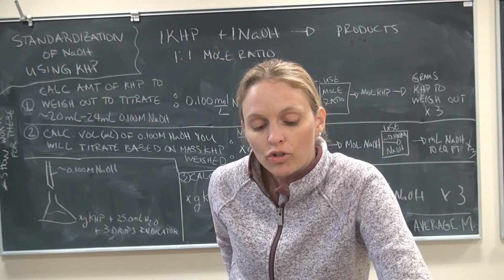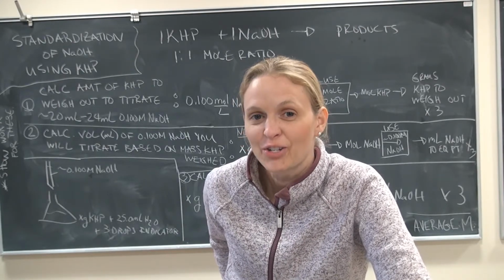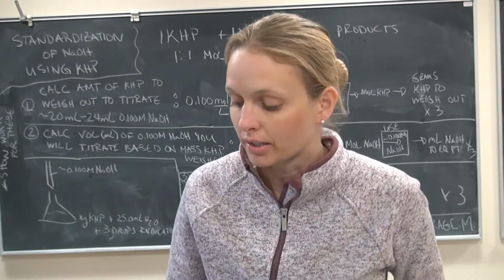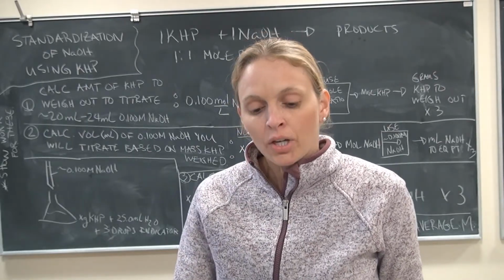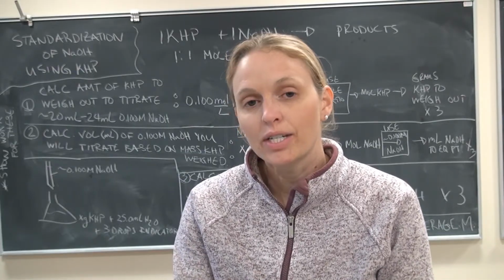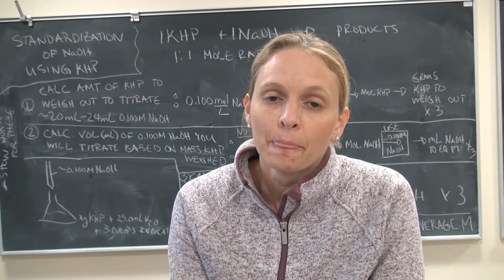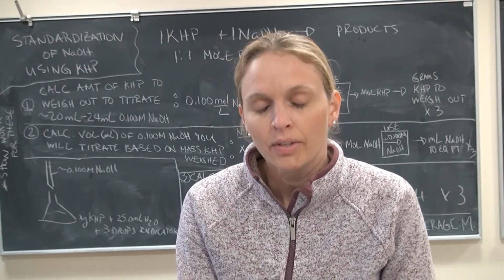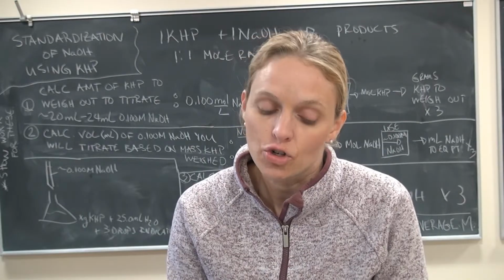So if that sodium hydroxide concentration that we're using is not actually that concentration, then all of our other calculated numbers are not really going to be that accurate, regardless of how accurate we are on the technique. So what we do is we react the sodium hydroxide, whatever the titrant is that you're putting in the burette, in a separate reaction before we use it and figure out what its actual concentration is, okay? And that's called a standardization.